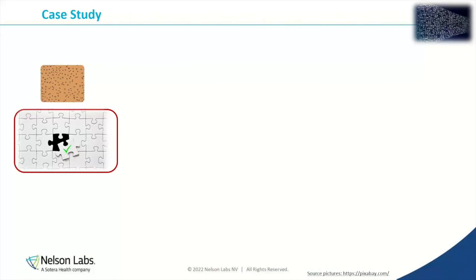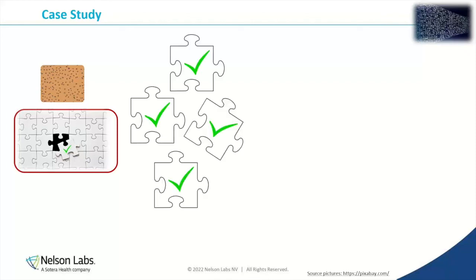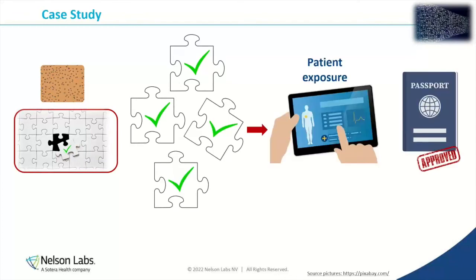where we had tested a full device and we got a failure. So we thought, okay, we're going to start our investigation. We're going to test each of the components separately. And in that case, we got a pass for each of the individual components, but combined, we couldn't find a cytotoxic component. There wasn't a lab error, nothing different in the testing, nothing in the processing. We went through all the steps and there wasn't anything that we could point to say, this is why we're seeing a cytotoxicity failure. But cumulatively, all together, we're seeing that.